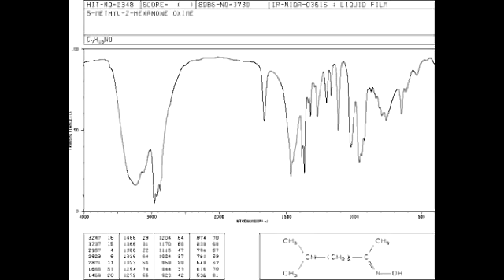So let's look at the molecule. Okay, so taking a look at the molecular structure and name now, we see that it is in fact an oxime with what we predicted in it. One thing we didn't note is, once again, there are lots of saturated C single bond H's here.